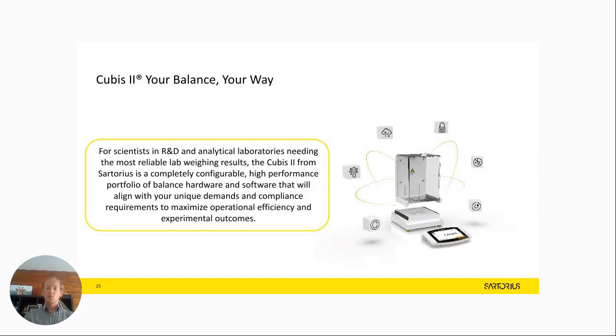Last comment on that: if you ever work in a hood, an isolator, or a weighing cabinet, you might need to level your balance. I run into a lot of regulation complaints that balances are not leveled. That means you need to screw the wheels so the little bubble is exactly where it has to be. Because if you are just one business card off on one side, you are off in the milligram range. So if you have a 4 or 5 place balance, you're off. That's why leveling is extremely important.